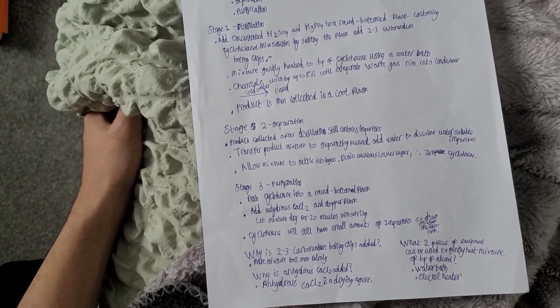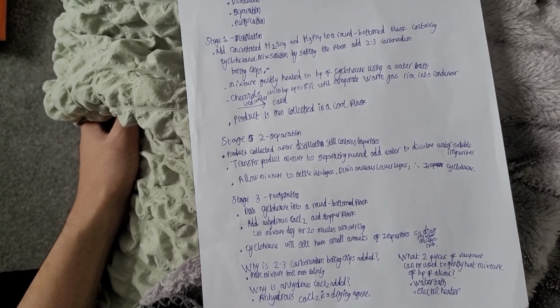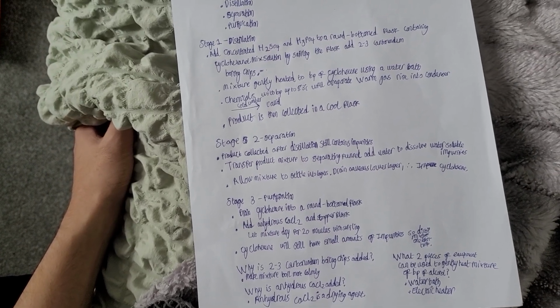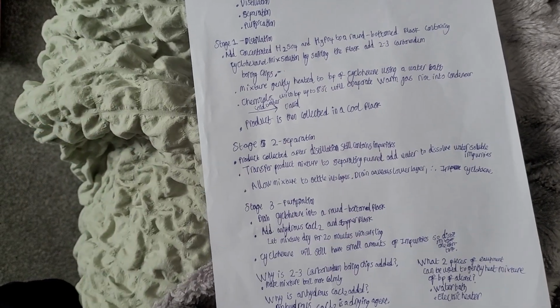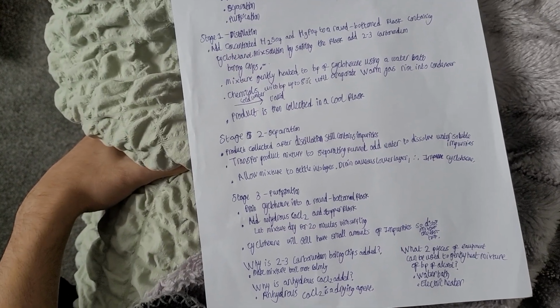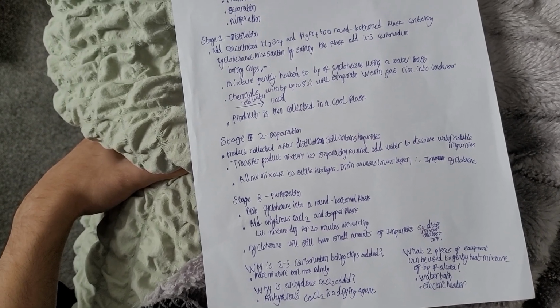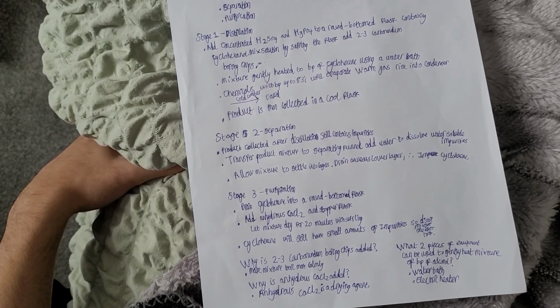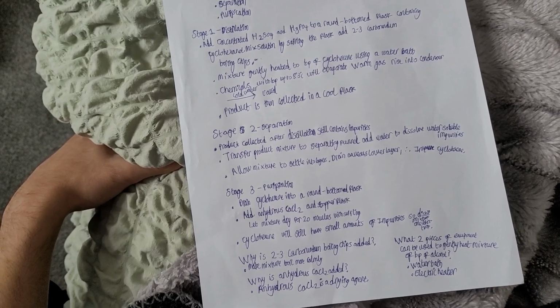Stage 2 separation. The product collected after distillation will still contain impurities. So we want to transfer the product mixture to a separating funnel, and we want to add water to dissolve water-soluble impurities. Then we want to allow the mixture to settle into layers, and we want to drain the aqueous lower layer, therefore leaving the impure cyclohexene. Stage 3 purification. We want to drain the cyclohexene into a round bottom flask, add anhydrous calcium chloride and stopper the flask. Let the mixture dry for 20 minutes with swirling, and the cyclohexene will still have small amounts of impurities, therefore we distill the mixture one last time.